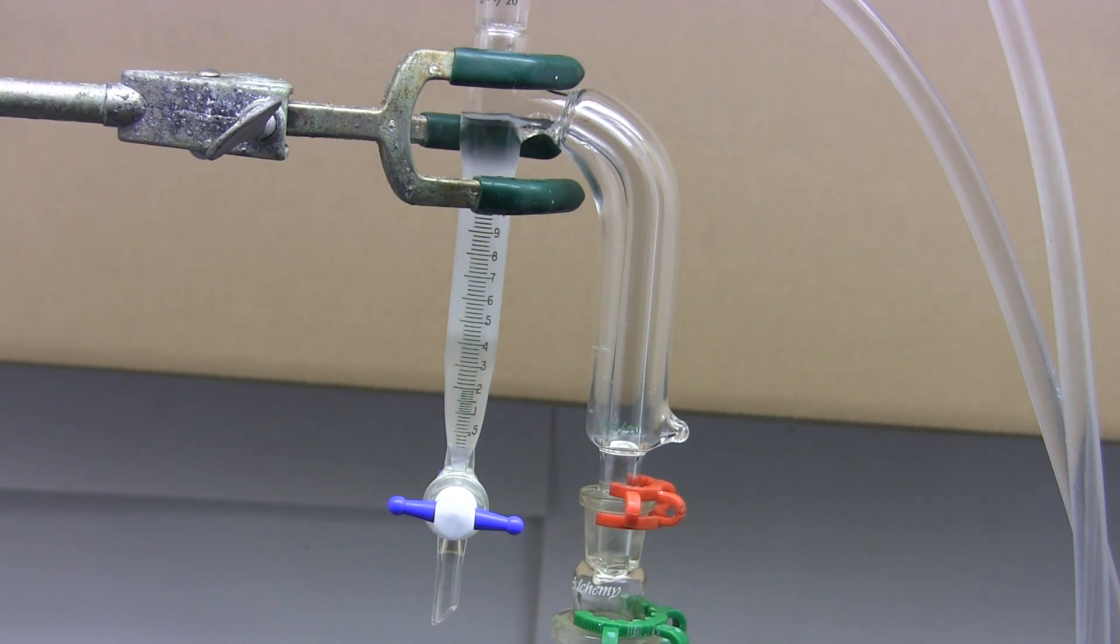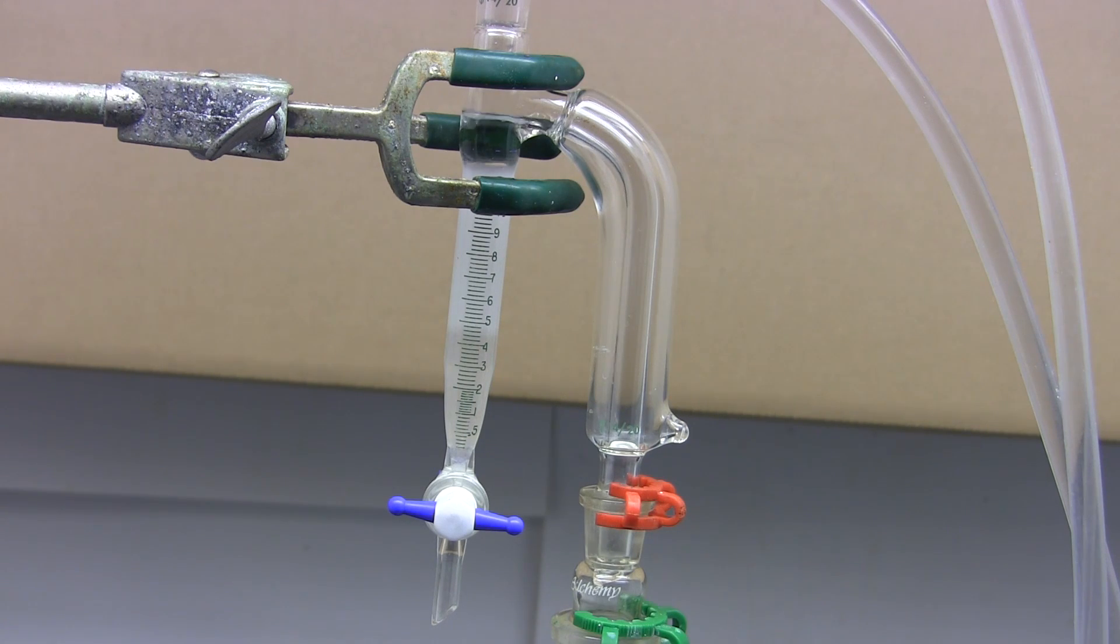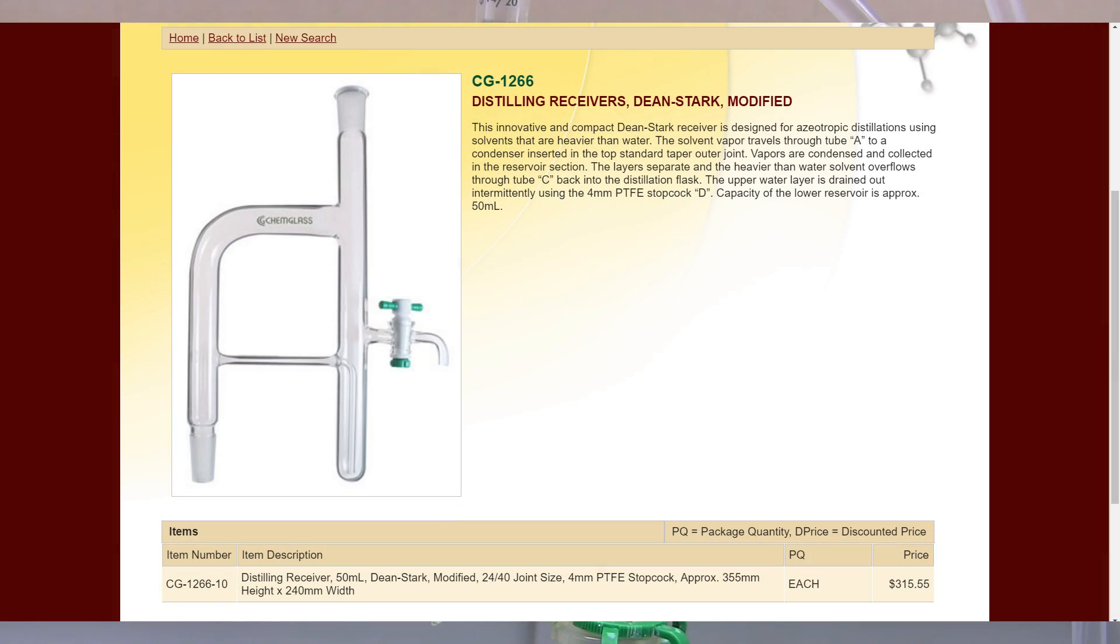But what if we want to do the opposite? What if we want to return the heavier phase and keep the light phase? This is especially important for herbalists, botanists and other scientists that collect oils and chemicals from natural sources. They use steam distillation where boiling water carries the oils out in the steam. This professional Dean-Stark trap only returns the lighter phase and cannot be easily modified to return the heavier phase. We could purchase a trap specifically for returning heavier phases but those are even rarer and more expensive.